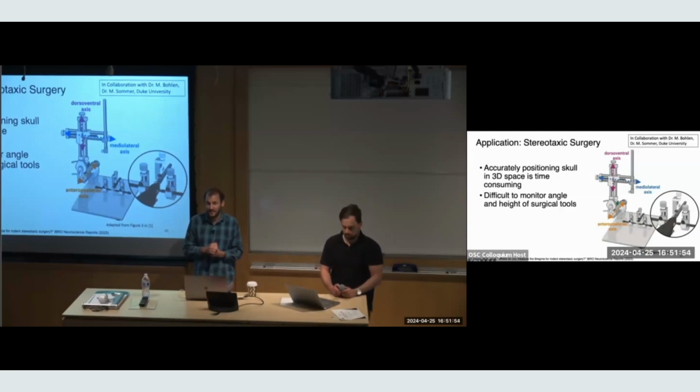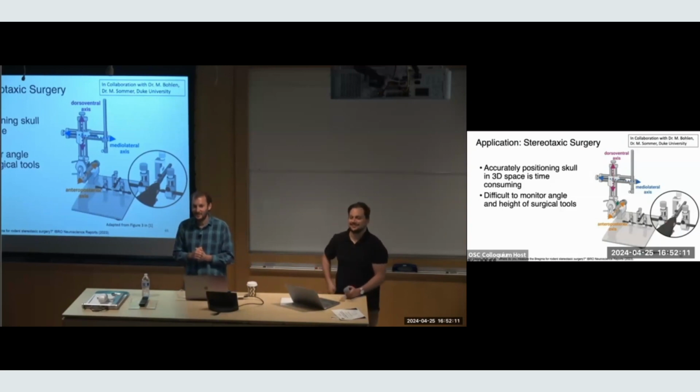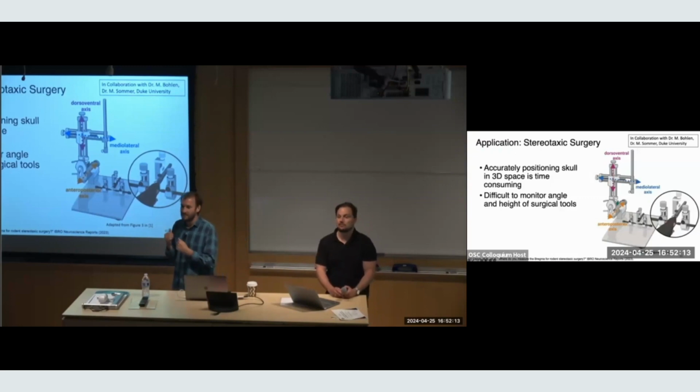Quick question for some of these biological applications. I'd assume that synchronicity between your cameras is important. You're going to grab frames from all 96 with some tolerance. How did you handle that? Do you have any tips or tricks? Get a giant FPGA. That's what we did. These are synchronized up to 6 microseconds, which is just the FPGA's electronic tolerance.